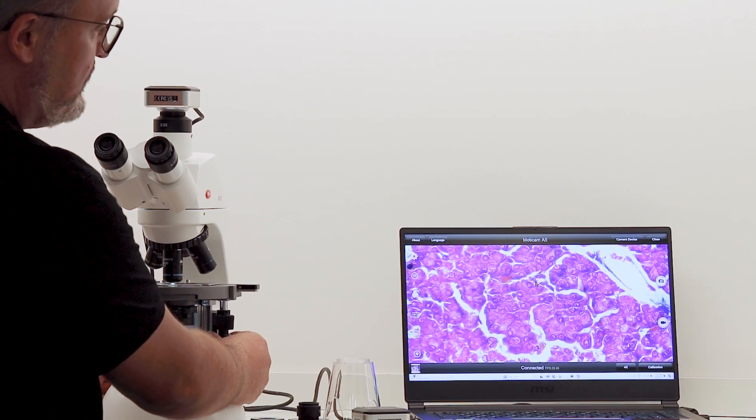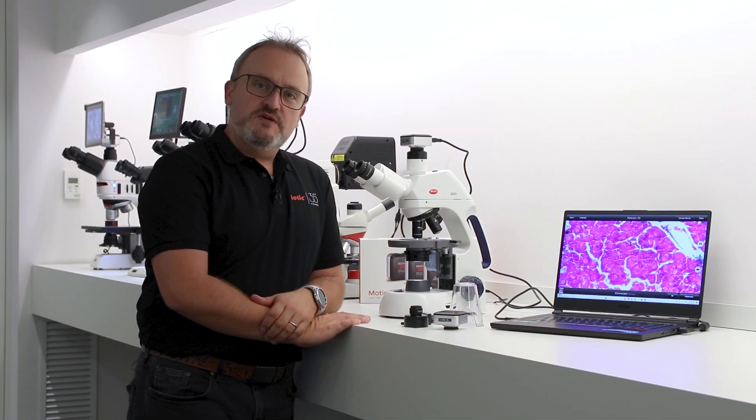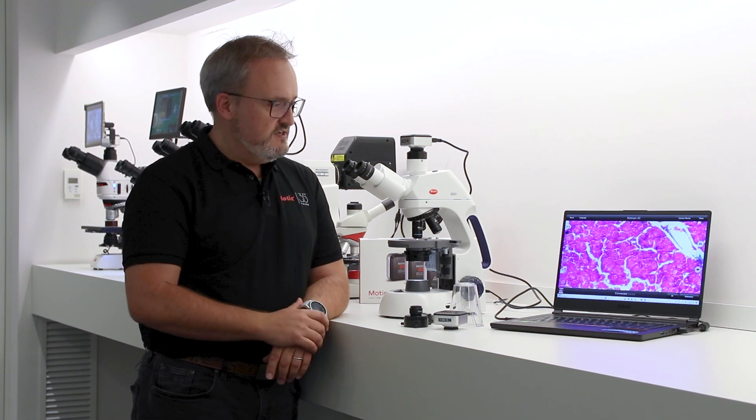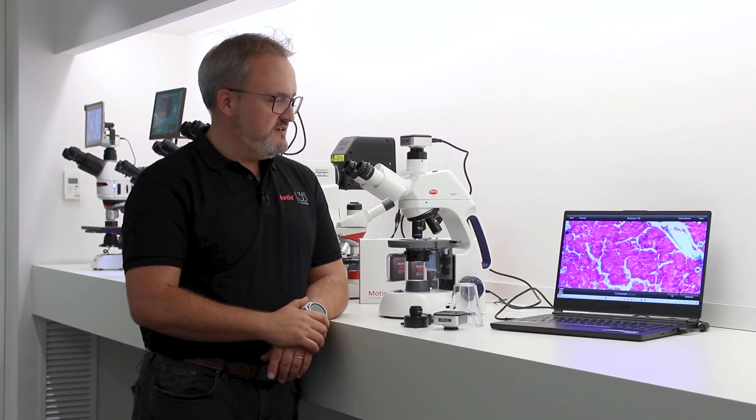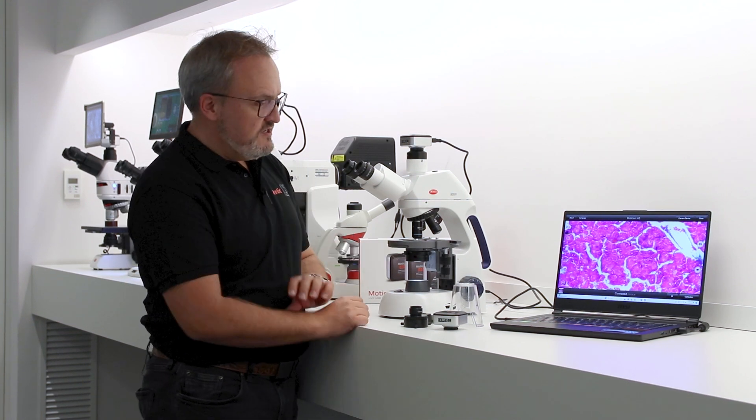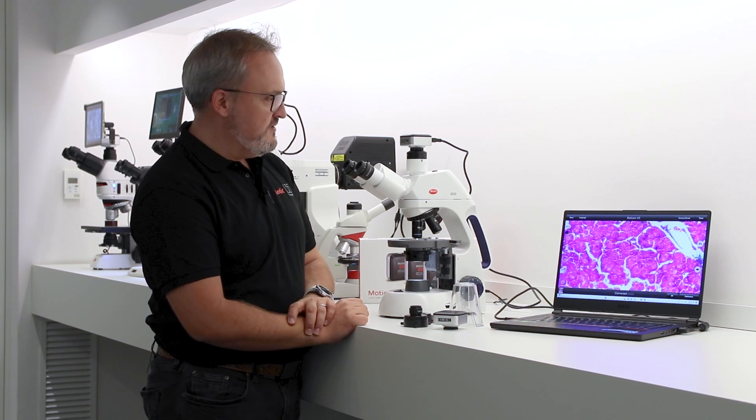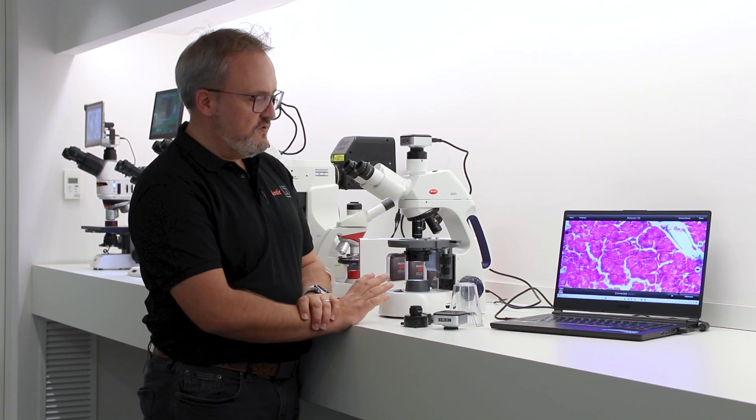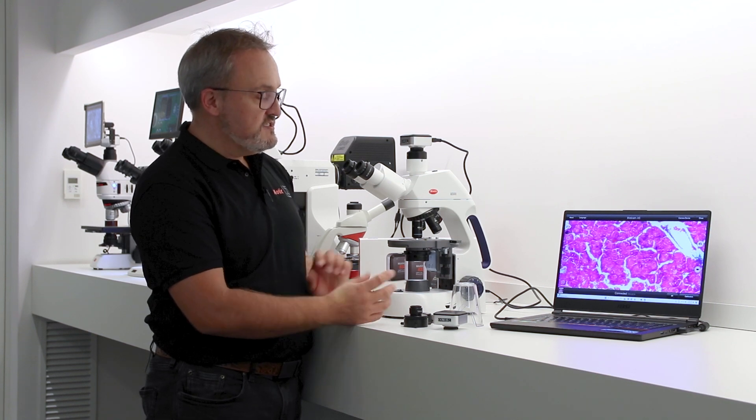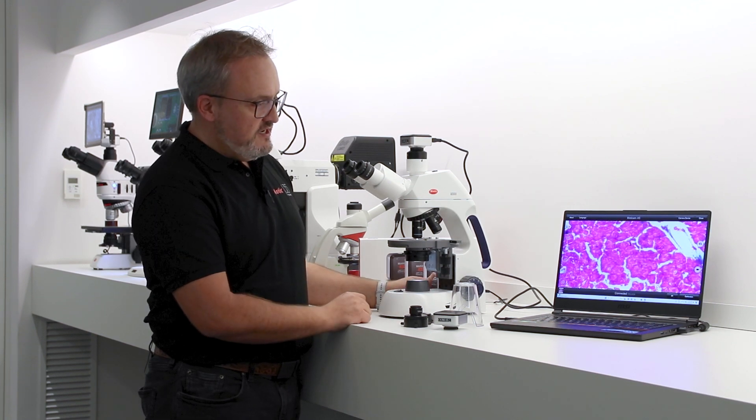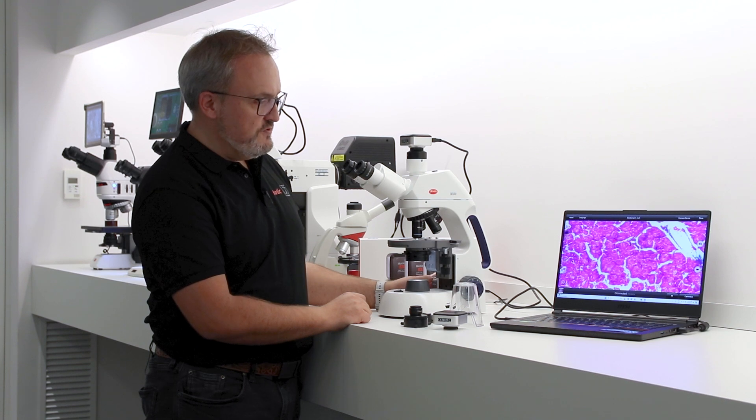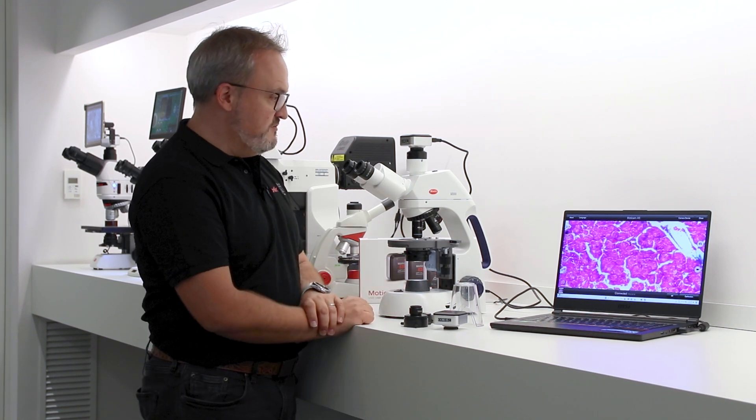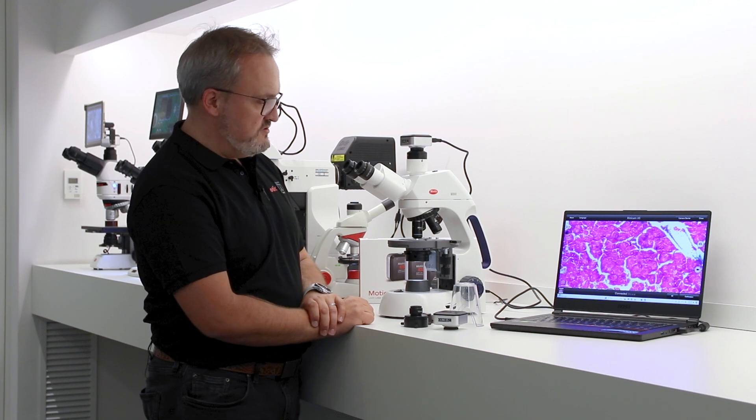The A5, the 5 stands for it can do up to 5 megapixel live transmission onto your computer, so you can really see things in high detail. With it being a specifically manufactured camera with sensor for microscopy, it means that you can still, even with 5 megapixels, achieve very fluid 29 to 30 frames per second on your live image on your screen.